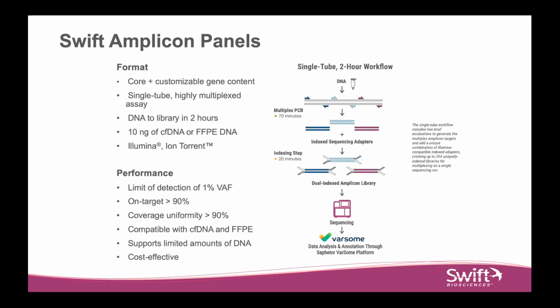These panels, we do a high degree of quality control and balancing to confirm that they are performing at greater than 90% on target and greater than 90% coverage uniformity.